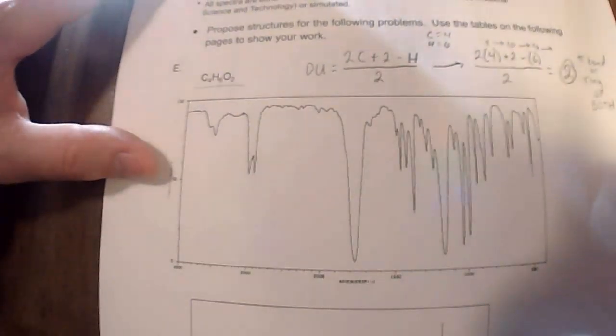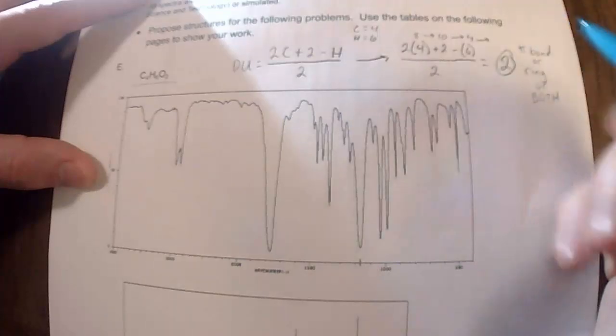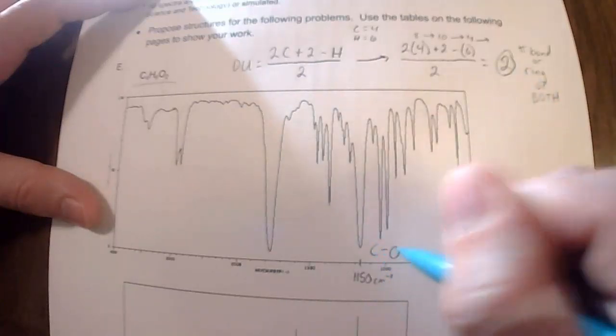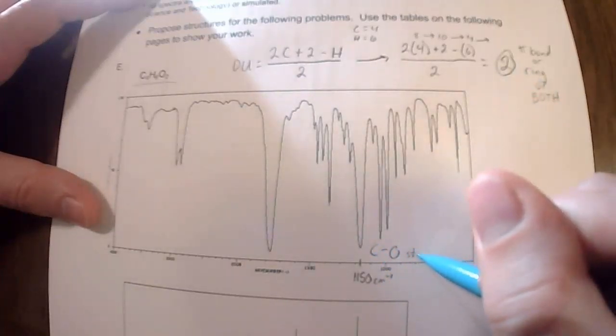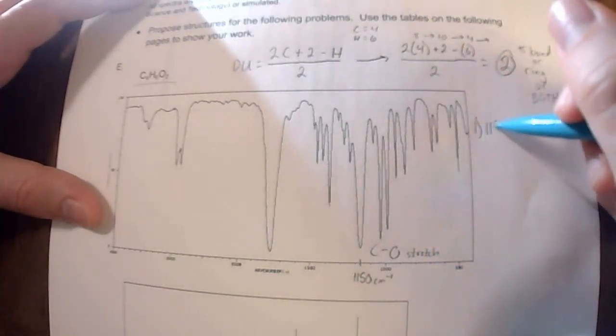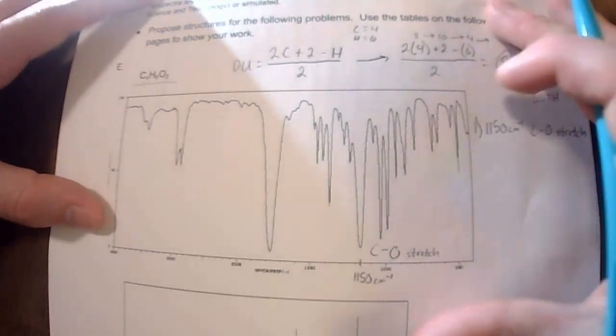So starting with our first spectra, let me point out a couple of key points. We see at about, let's call this 1150 mark, a CO stretch. So a carbon bound to an oxygen. I'll just write this off to the side as well. CO stretch. And that would account for one of our 2 oxygens.